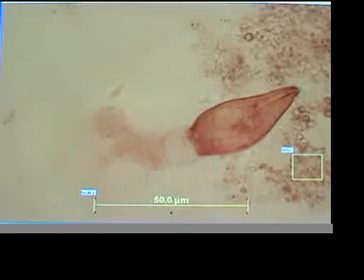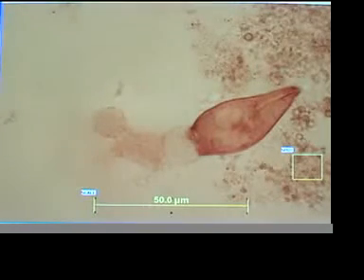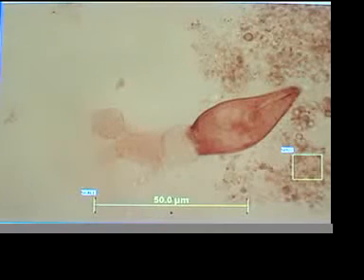Let me see what I can do with, I can adjust the focus a little bit. That organism is still alive on the right, and his cilia is still beating. We're going to watch him because if in fact this was two organisms connected and then devitalizing, that'll be the first time that that's happened. This definitely looks like too much mass for one organism. I think it's two organisms.